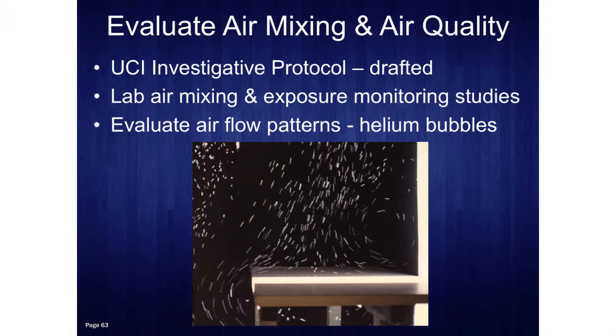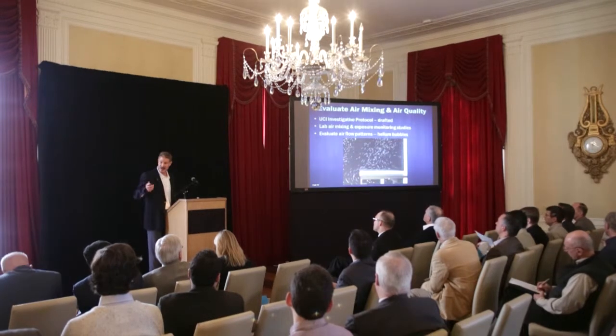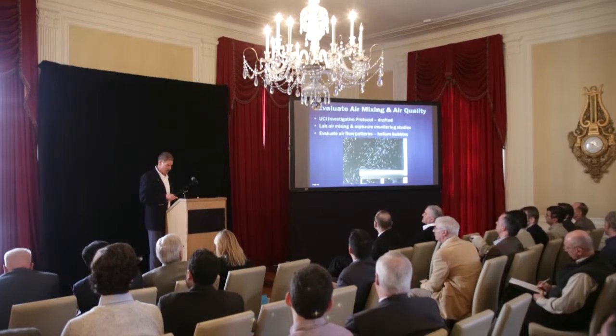So it's important to evaluate air mixing in your labs, and for that reason, we have drafted an investigative protocol, which you have a copy of in front of you in your packets. This lab air protocol correlates, we're trying to correlate lab air mixing with exposure monitoring studies. In fact, we're using helium bubble studies to evaluate airflow patterns. And David, in a little while, will talk more about that.